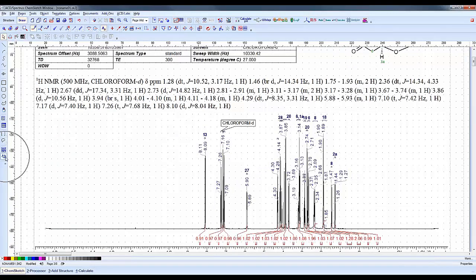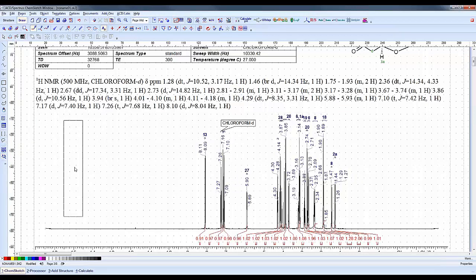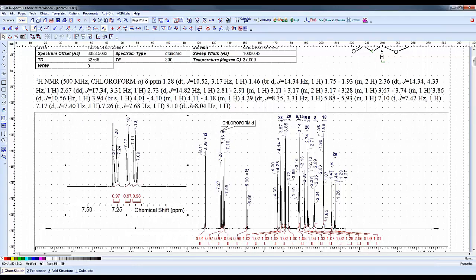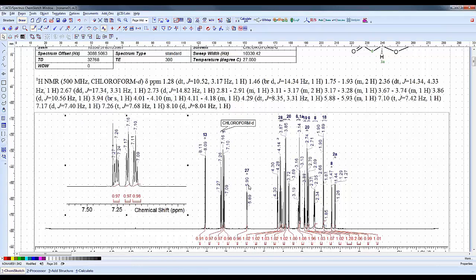We have our proton NMR spectrum. We can create an inset using this button here. I'm going to highlight the region I want to create an inset for and expand it out.